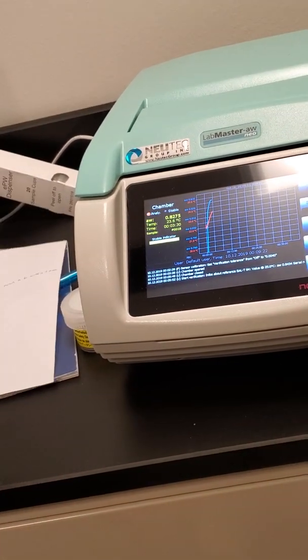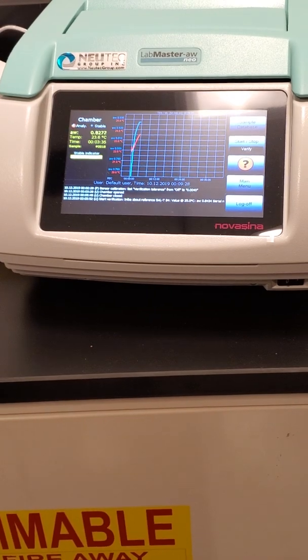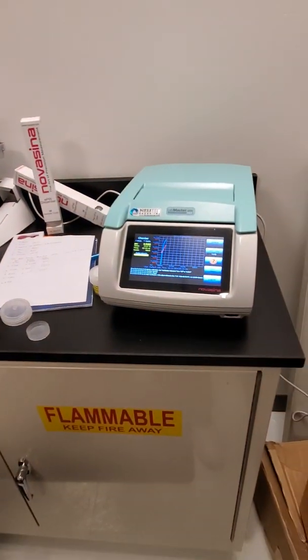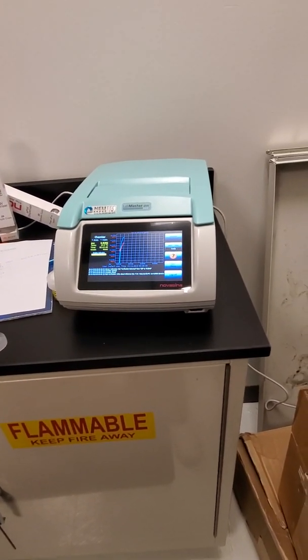So anyway, that's there for you. And those are readily available. You can buy them in packs too if you want more than one. They will saturate eventually, and you can wash them out and kind of reconstitute them, but you can also just buy new ones.